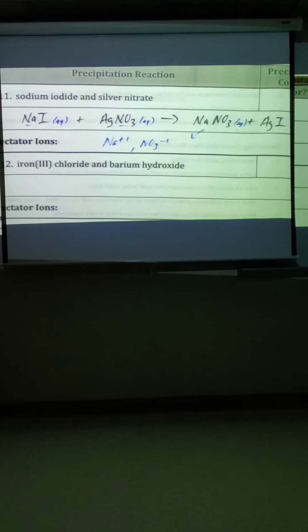Going to do the same thing again with lead nitrate once more. And now with potassium dichromate, watch for observations. There's our color. Now we have lead nitrate again. Potassium iodide.